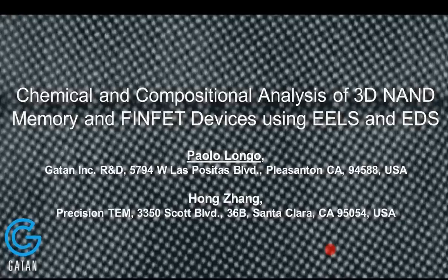So let's jump straight into the questions. The first question actually came in kind of early. It didn't say what microscope voltage we were using in the presentation. And is there an advantage to going to lower voltages, especially with the damage that you may be seeing?